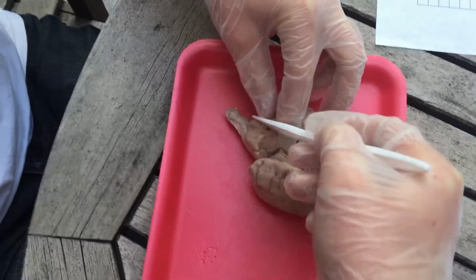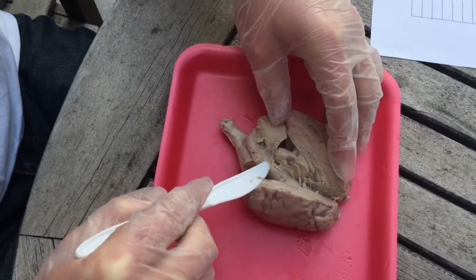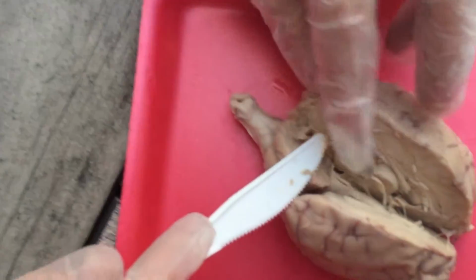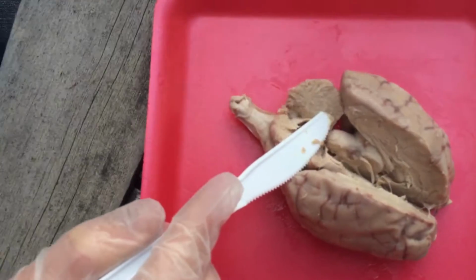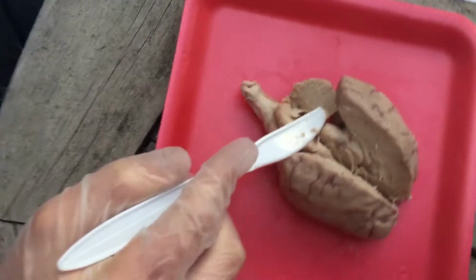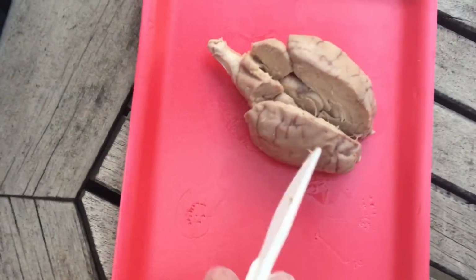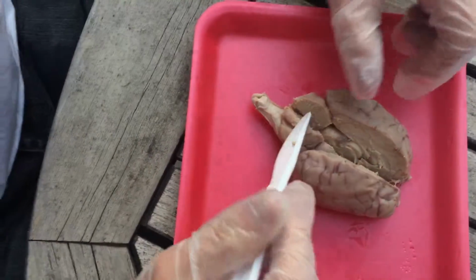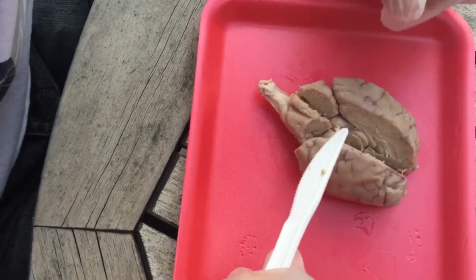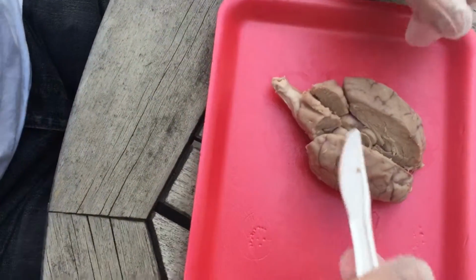And then if we cut open the cerebrum, we have, this is hard, we have gray and white matter. So white matter connects gray matter areas and carries nerve impulses between neurons. And gray matter is correlated with muscle control and sensory perception.